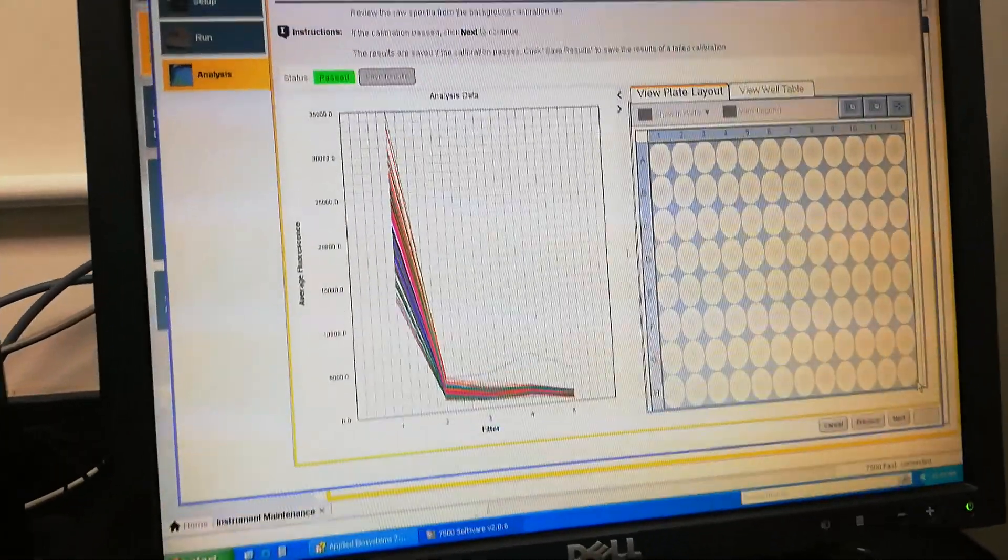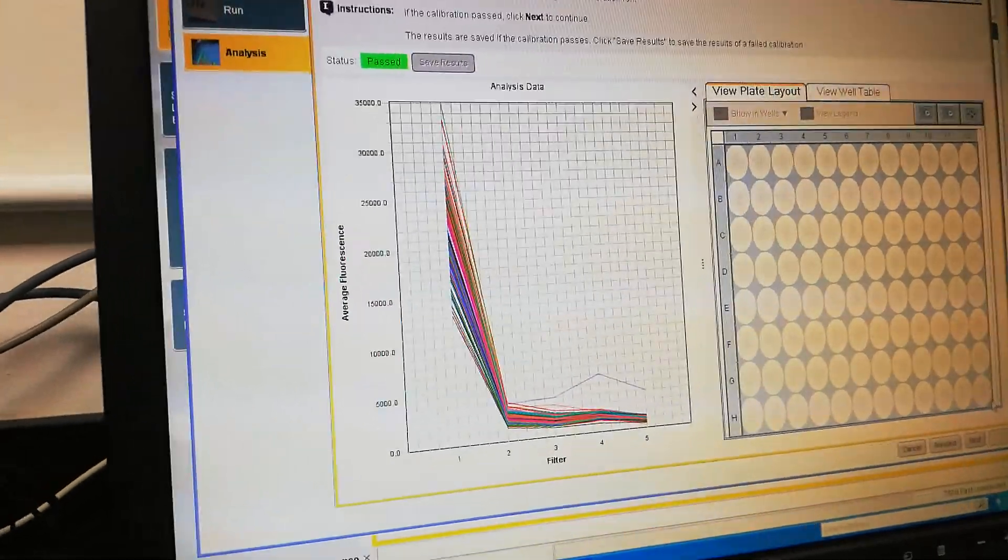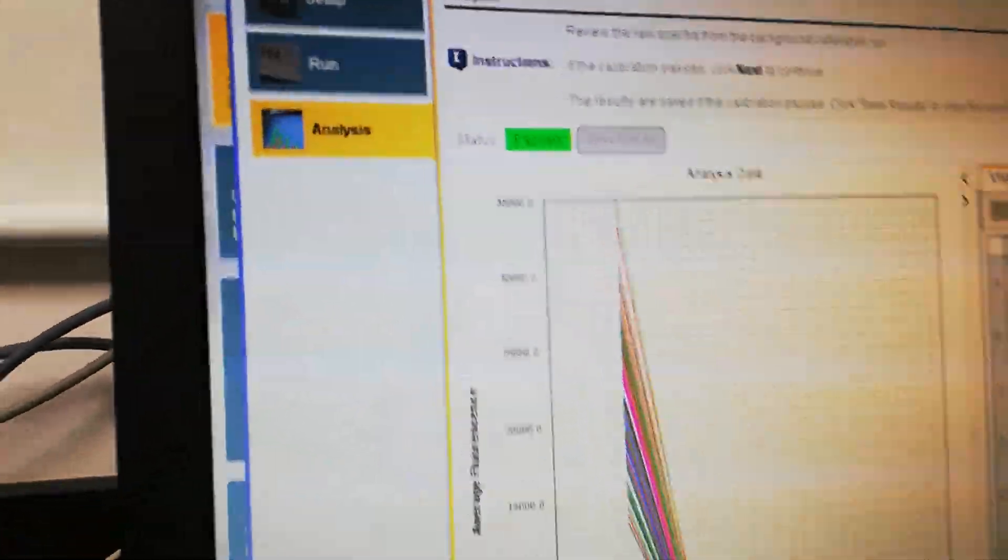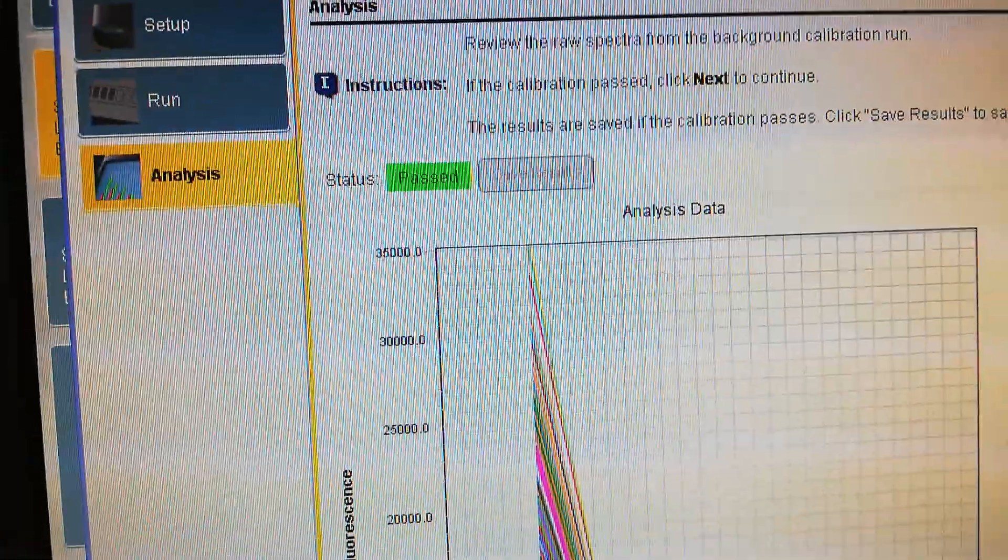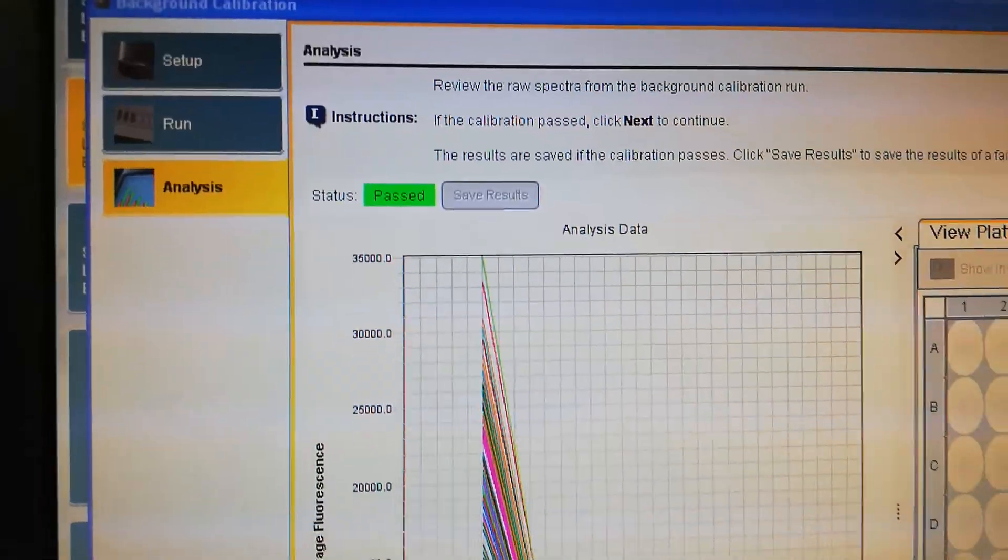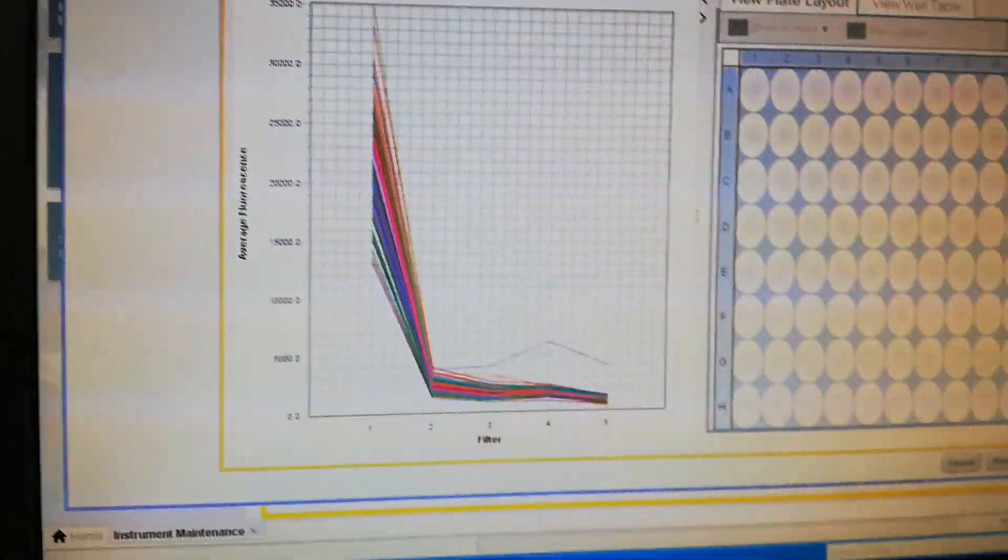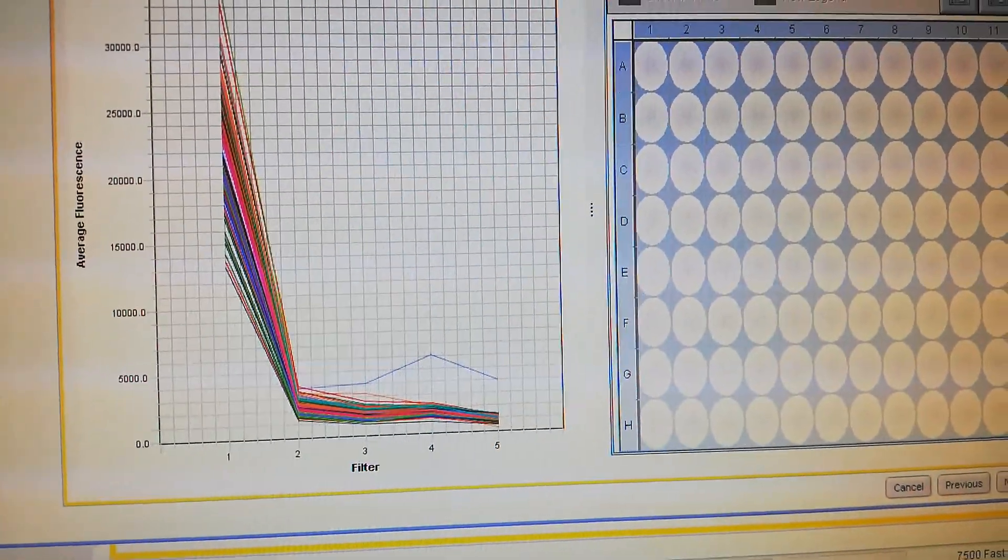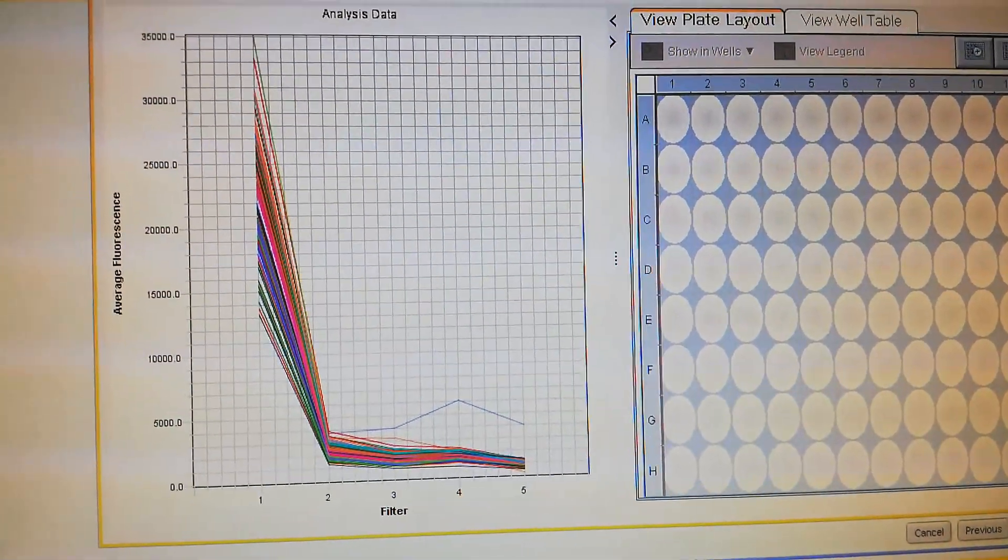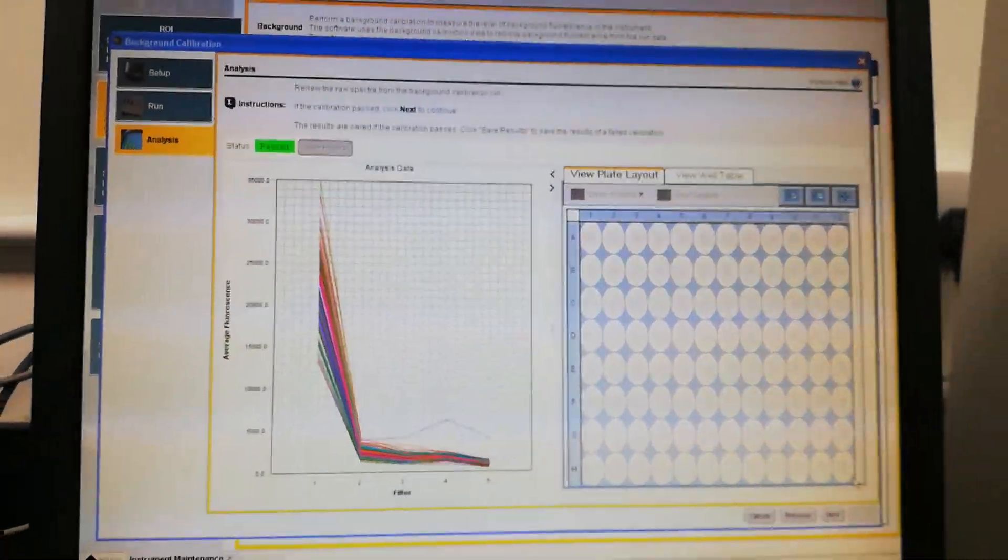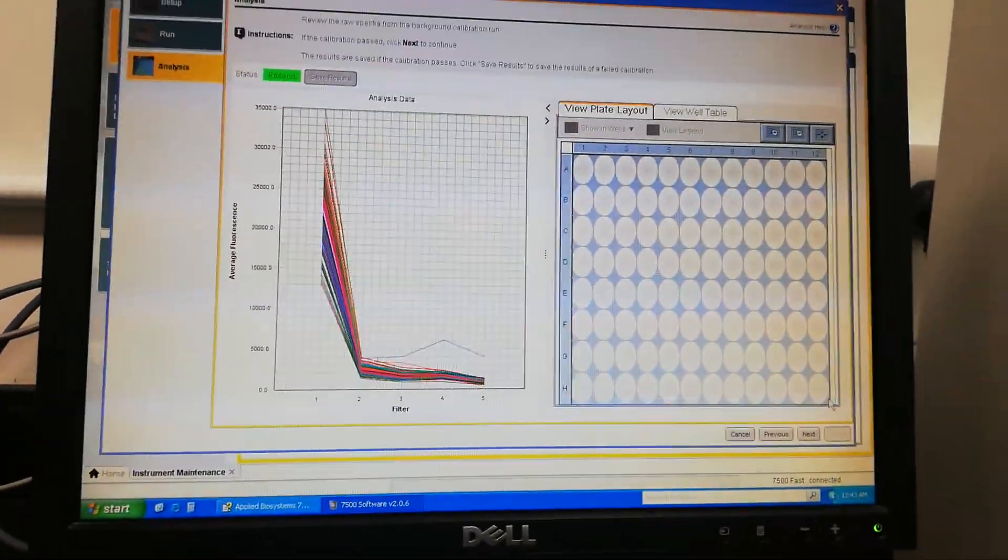Finally, it shows that the background calibration has passed, as you can see here.